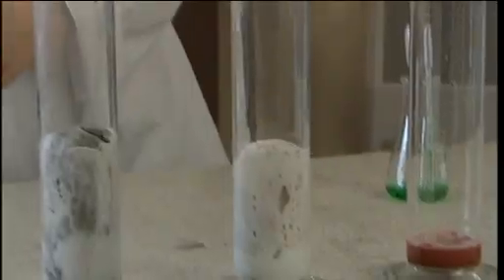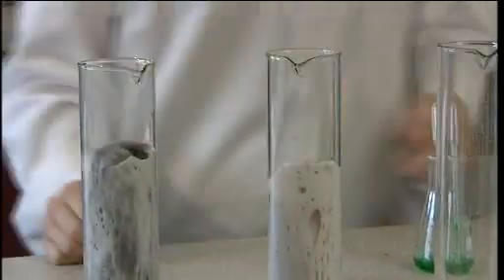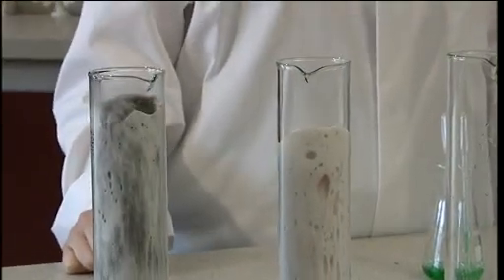This demonstration is a fun way of showing the effect of different catalysts on the rate of decomposition of hydrogen peroxide.